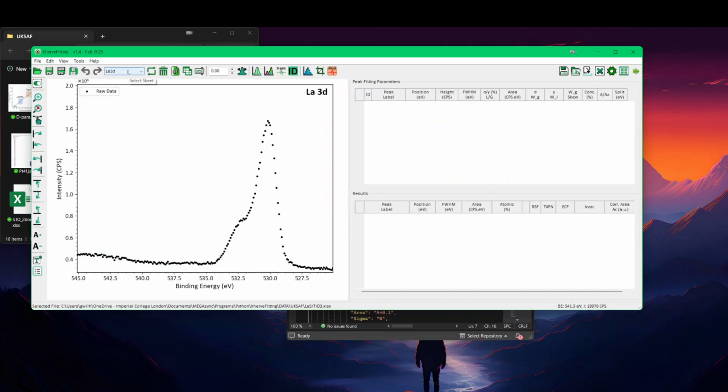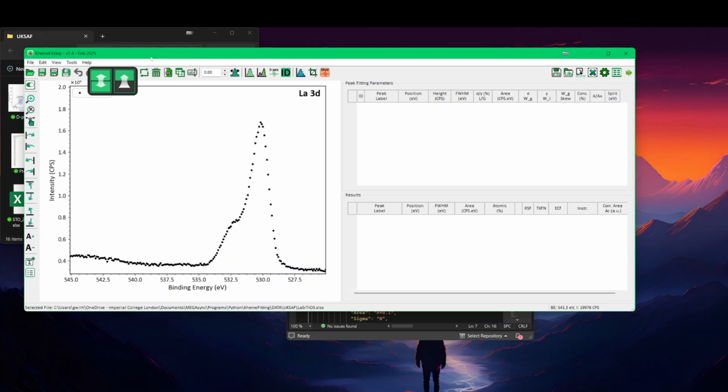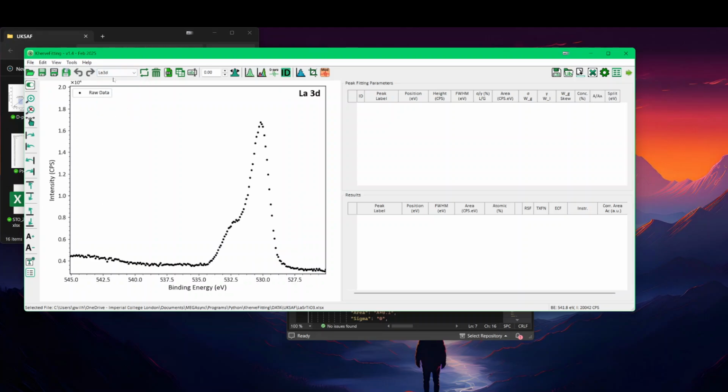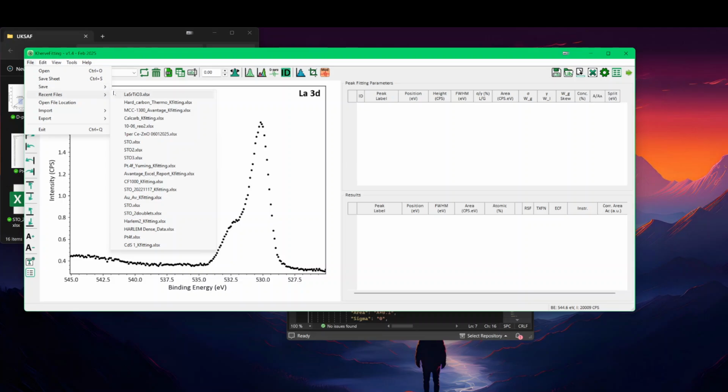So it's a bit not working too well yet, but the next version I should be able to sort it out. But if you just try a few times, obviously we have the results grid, so this is not too good. I can save it, and I think this is what I made as a mistake, I didn't save it.